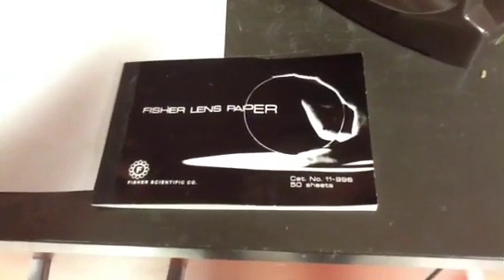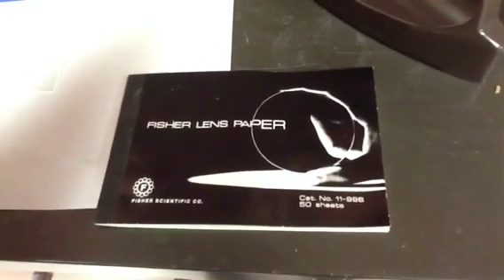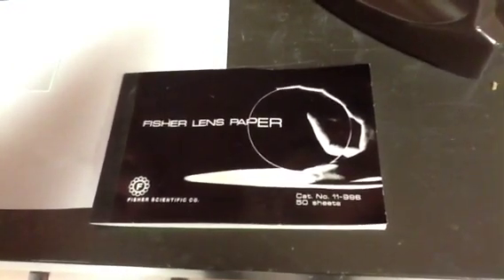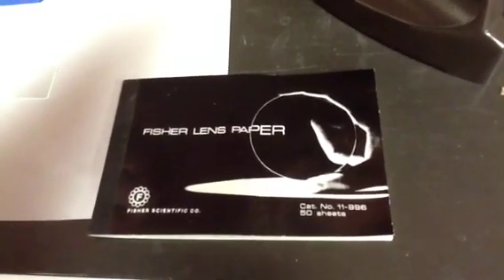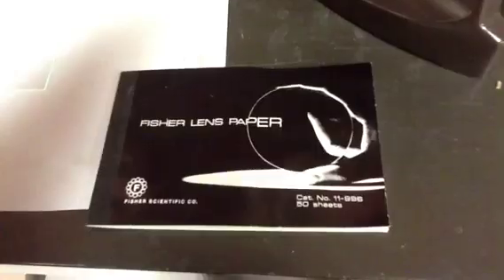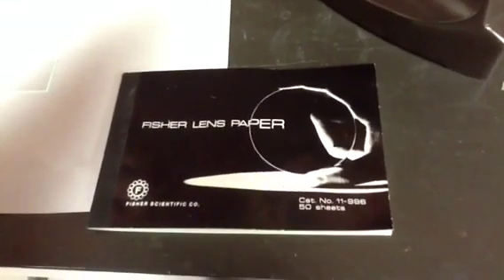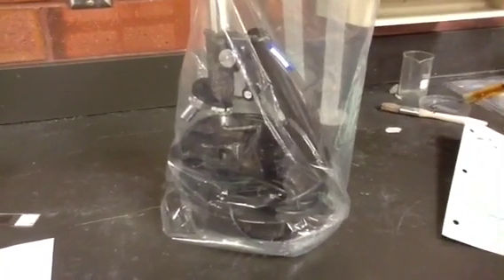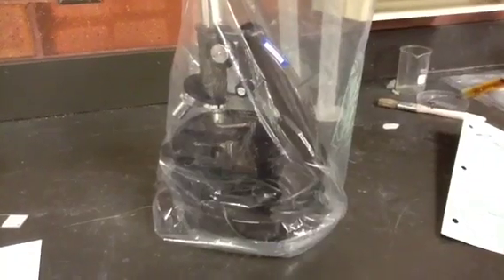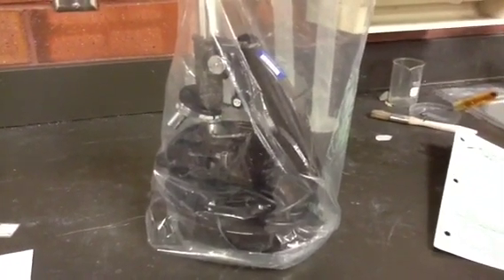If you find that your microscope is dirty, you can use lens paper to clean off the lenses. Tear out a sheet, get it a little bit wet with 1 drop of water, and then rub it on the dirty lenses. Make sure you don't ever use Kleenex or other materials. It can scratch the lenses of the microscope. When you're finished with your microscope, wrap the cord around the base of it, between the light and the arm. Then cover it with a plastic dust cover so that it doesn't get dusty.